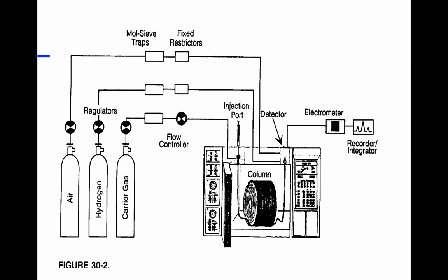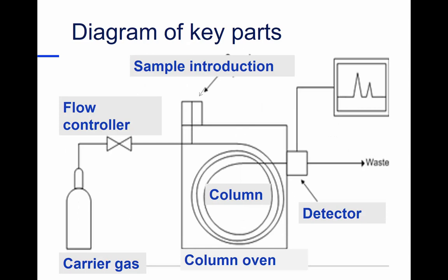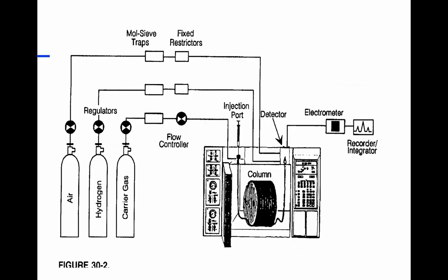We oftentimes have a detector over here that may be a detector that can work with this. But very commonly, we have a detector over here that is actually a flame. And I'll talk more about that later. So I need to have something that makes a flame, right? So hydrogen gas and air. So that's my two gases that come over to make a flame detector. So I've got, again, cleaning systems. I have control systems to control the flow.